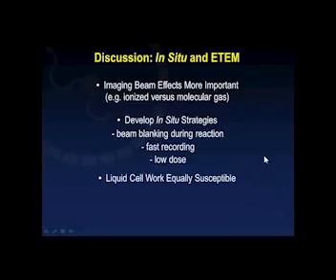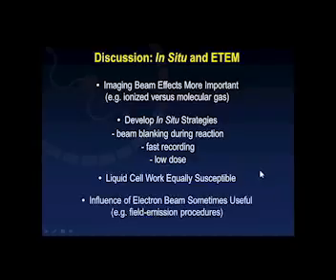And what I've shown is an example for gas cell work. My understanding, reading from the literature, is that liquid cell work is equally, if not more, susceptible. But on the other hand, sometimes the influence of the electron beam can be useful. For example, there have been groups which utilize the electron beam to trigger reactions. So it really depends on what phenomenon you are trying to study, and therefore plan your experiments accordingly.